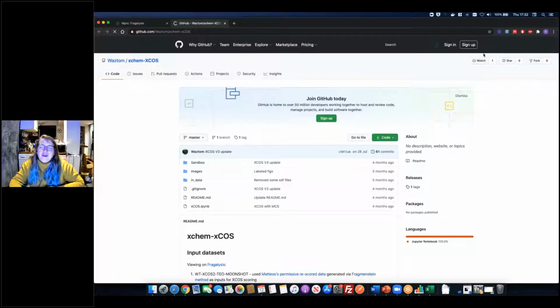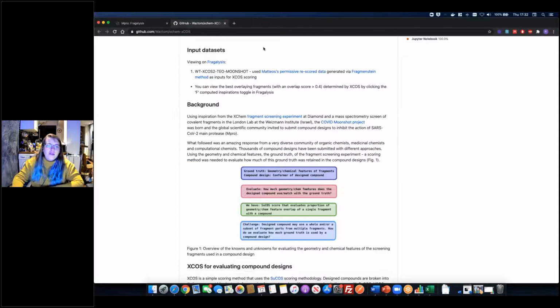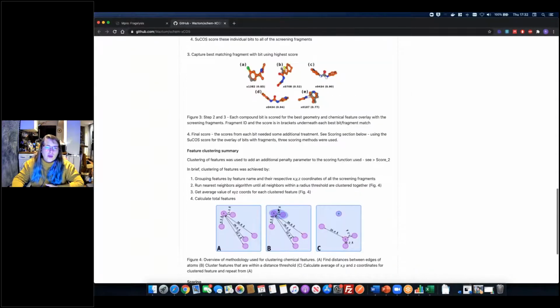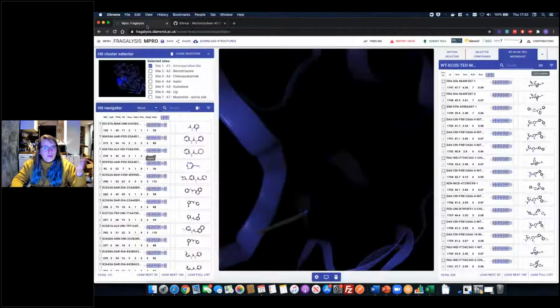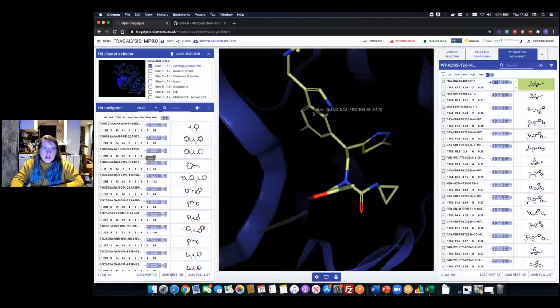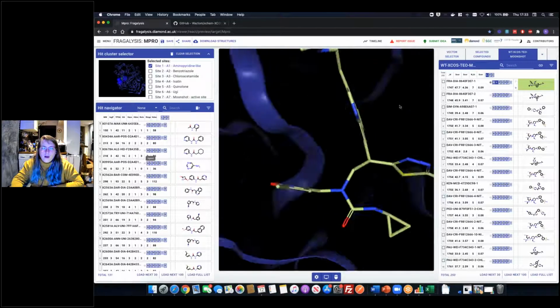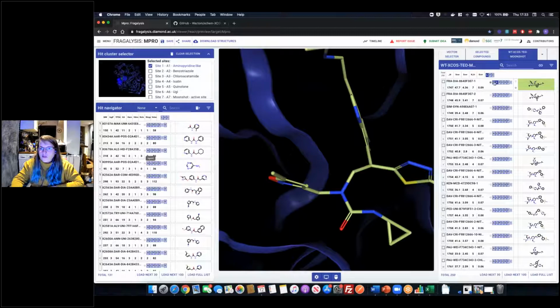Usually when you click on one of those link buttons, you'll be directed to a page that describes the method that's been used to generate the data set. So that's the quickest way that we can show what the actual science going on behind this data is. And then for these data sets, when you upload them, I can show you the upload page shortly. You essentially have a 3D structure, so you can turn on a ligand and it'll present them as a licorice model and show you where it is in reference to the reference protein and the aligned structures.